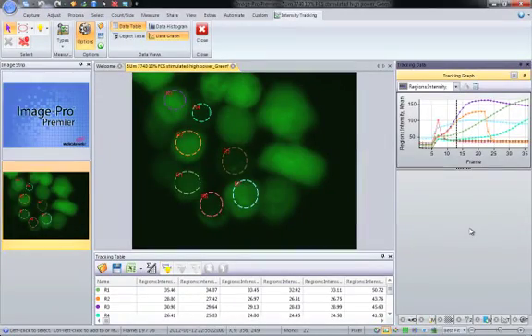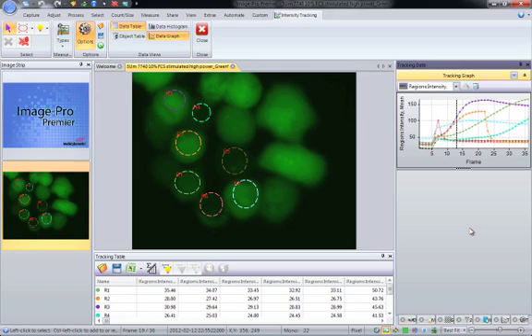Okay. That is it for data tracking. As you can see it is really easy, but if you have any questions, do please get in touch with your local sales representative or dealer. Thank you.